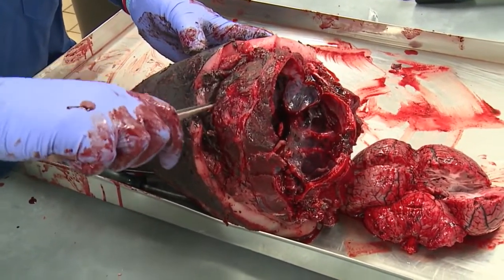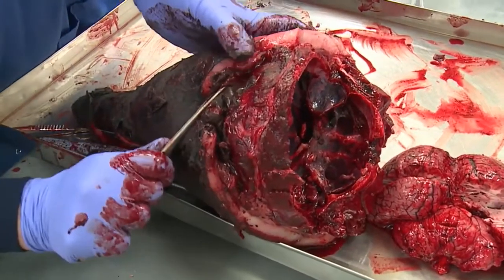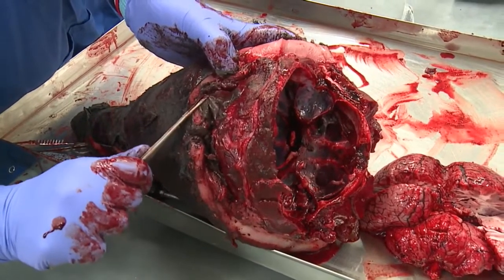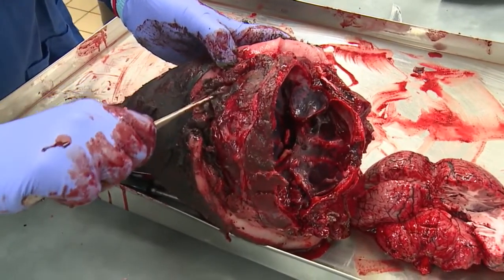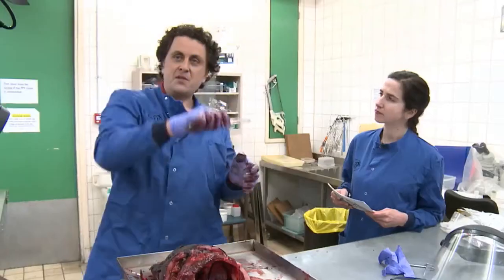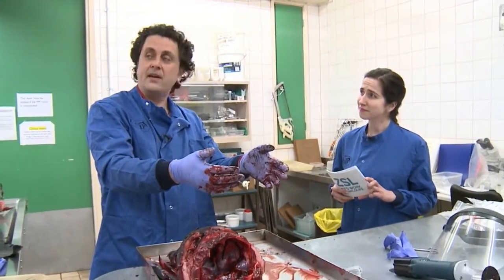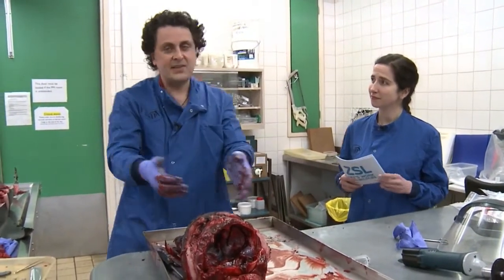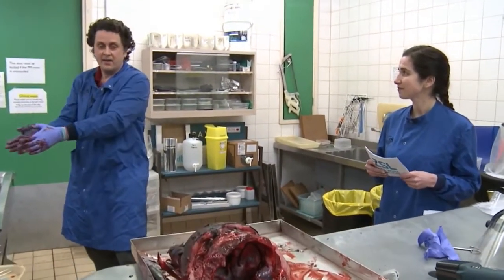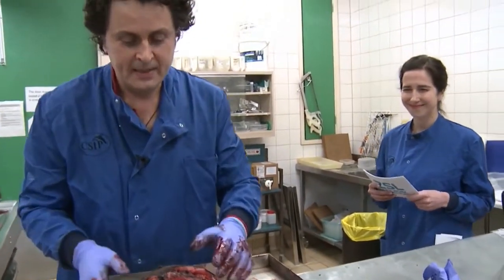There's a soft fleshy pad just there, sort of greyish in colour, holding out. Is that clear? See that? Yeah, that's called a monkey or a phonic lip. So basically they're held quite tightly against the front of the skull like this. The pulse of air goes past them, it pushes them away, and then because they're held quite tightly, they snap back under elastic tension, and they make a noise. You send pulses of air, and that's how they make the noise.